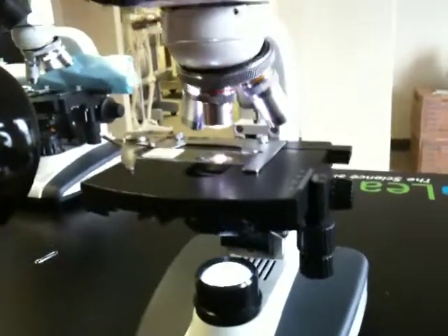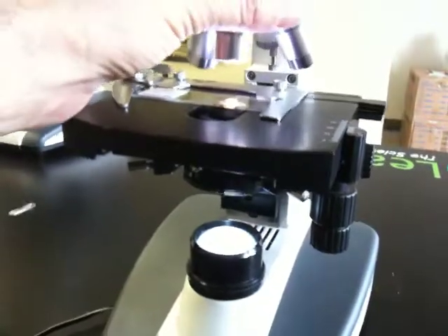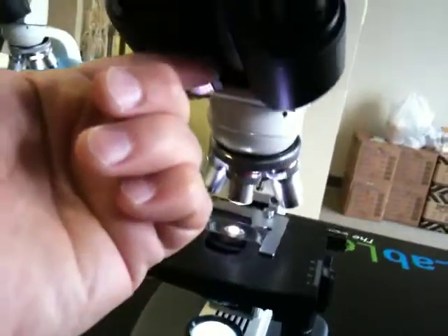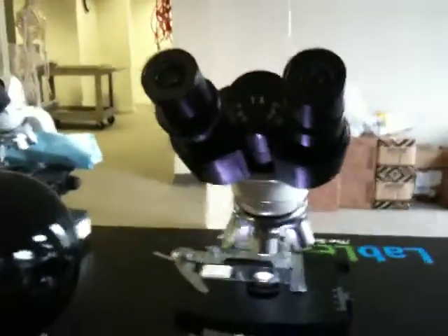However, some of the schools are calling and saying that even though the light's on and they have their objective in place, none of the light is actually coming through and entering the tube, and so they're seeing nothing through the eyepieces.